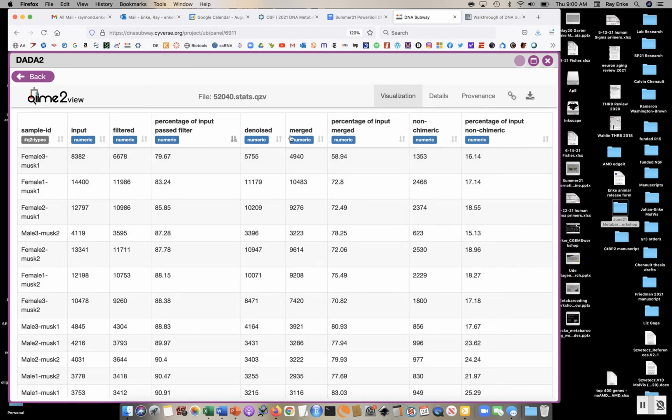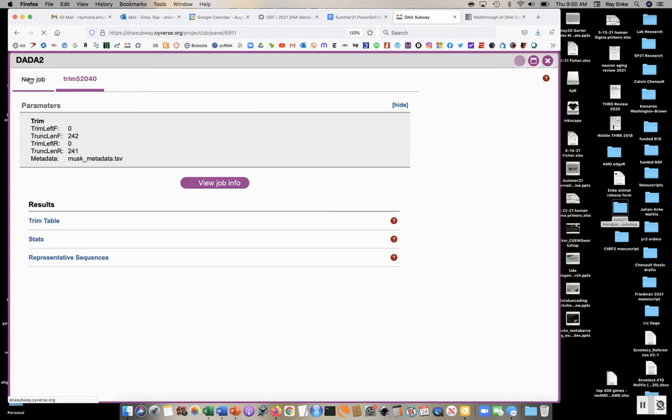And then you have some other metrics down here, which are just giving you other quality metrics that we're not going to talk about here. Okay, so that's the stats table. It's important to look at the quality of your reads.